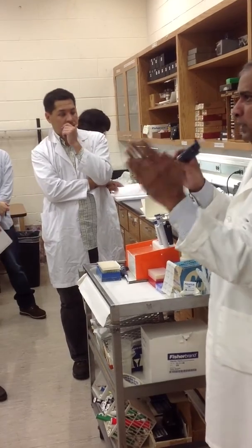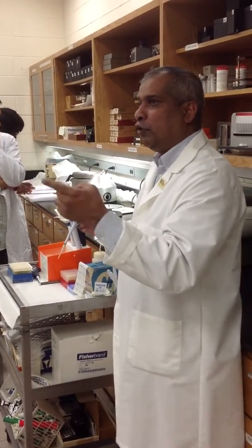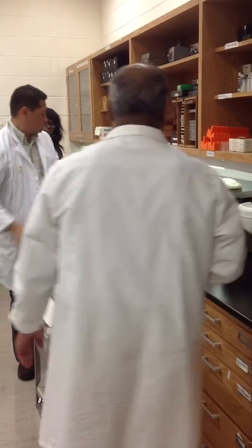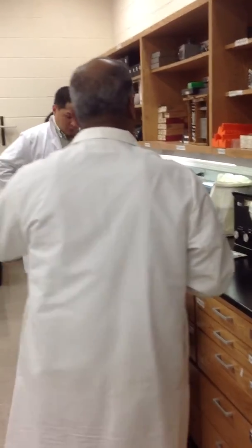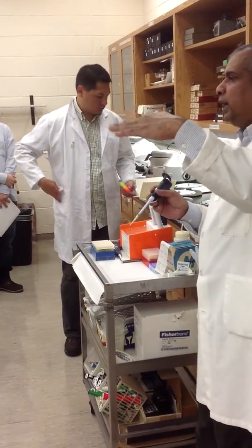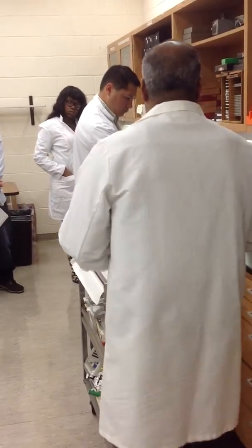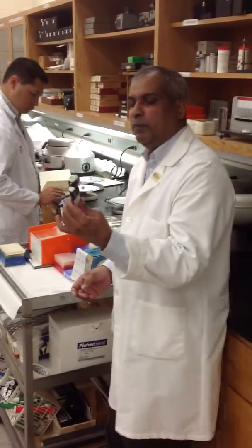So we do, in our field, go down lower than the micro level, but you should know and do that. It's good to just memorize, right? If you go up, you have what, hecto, kilo, and so on, right? Yeah. All right, so pipetting, everybody's going to have to learn the pipetting.